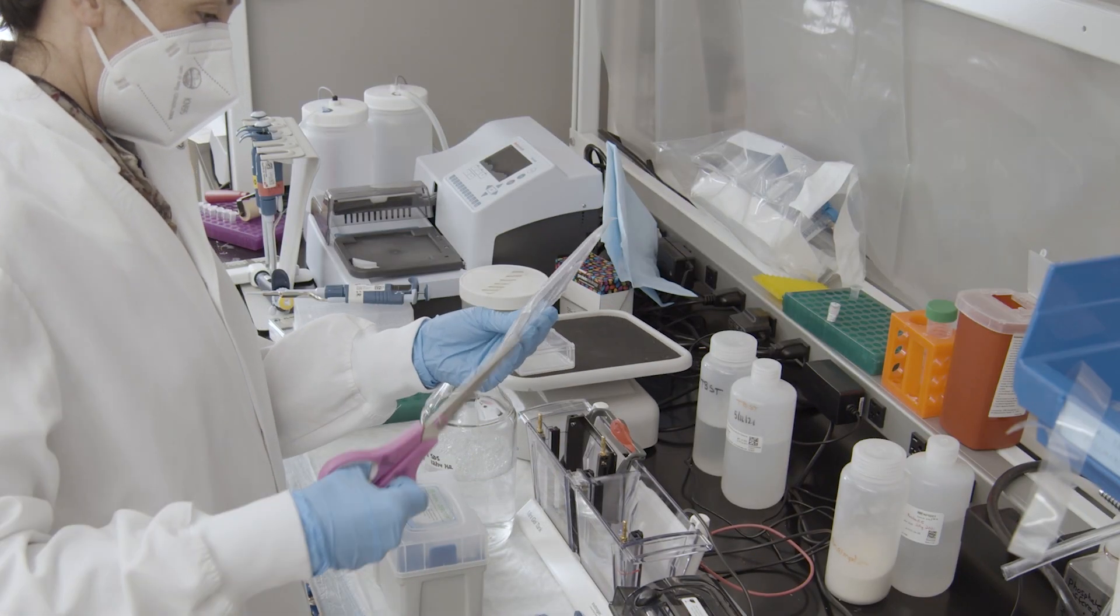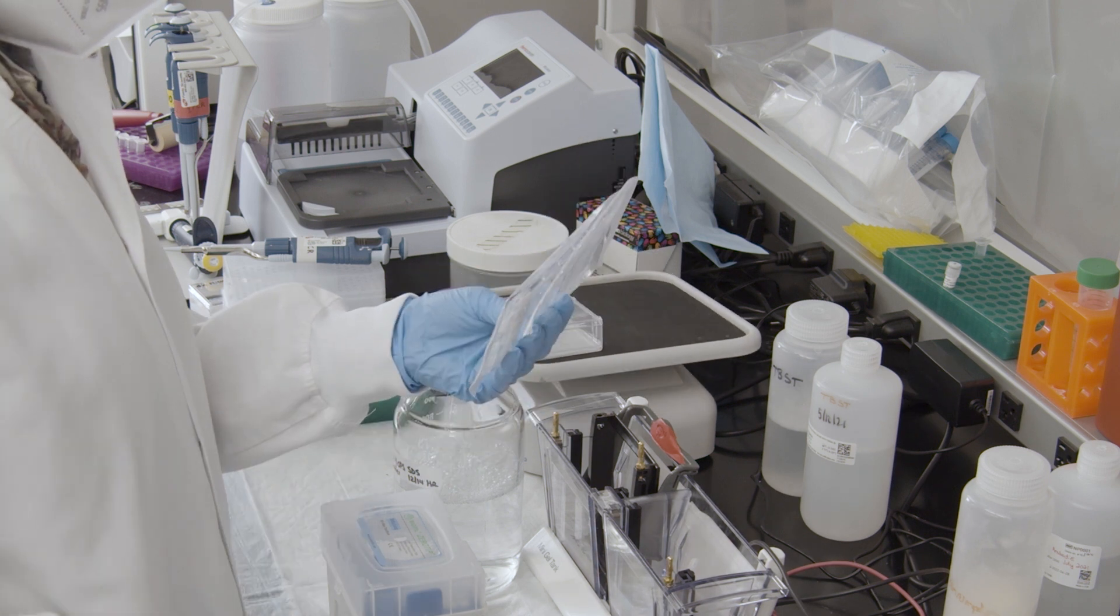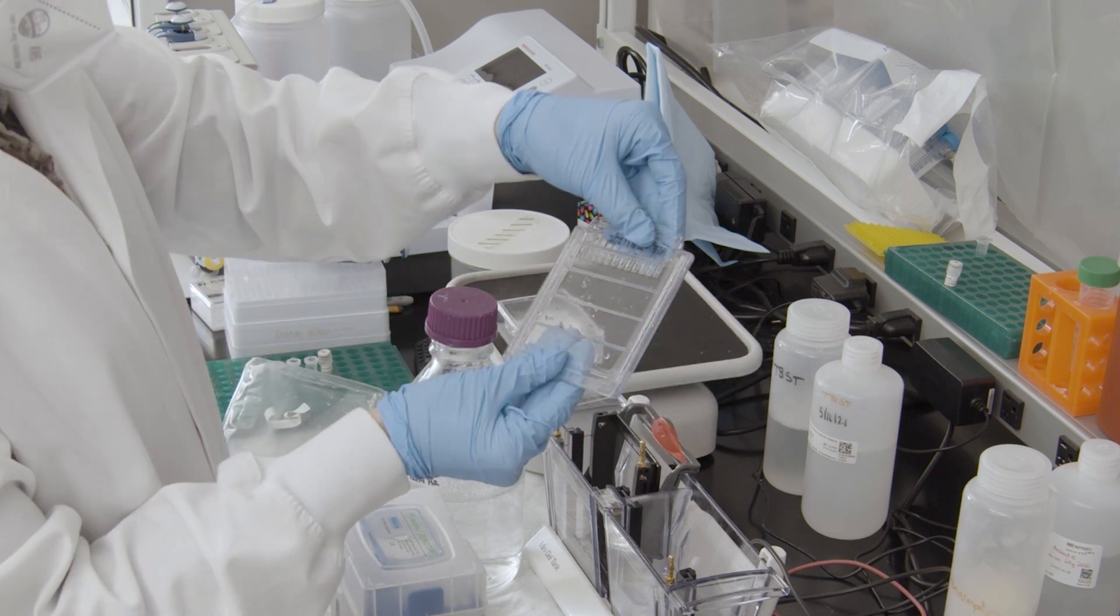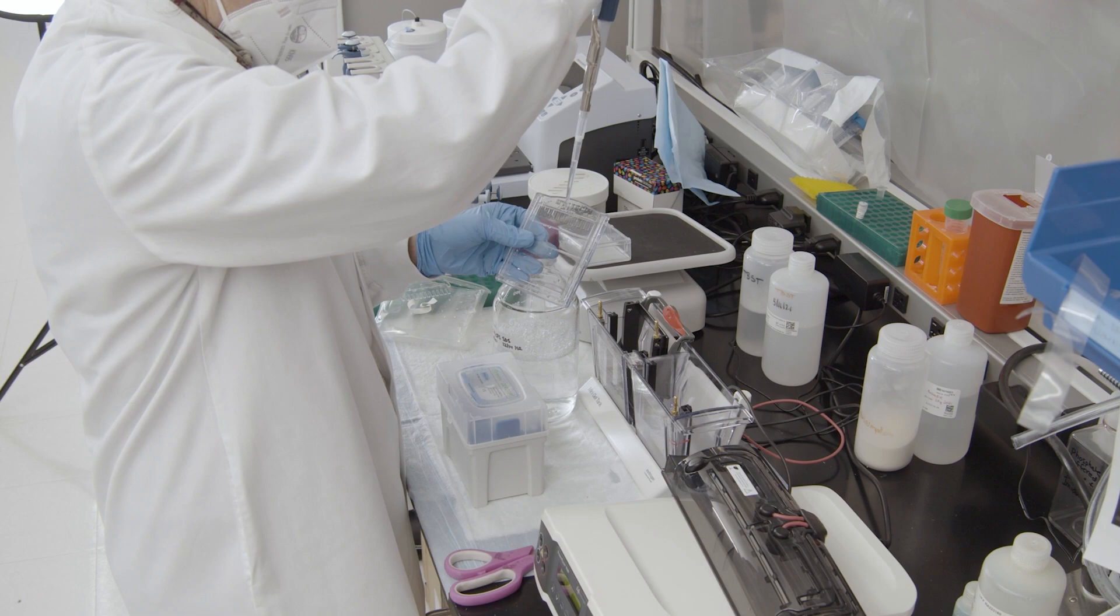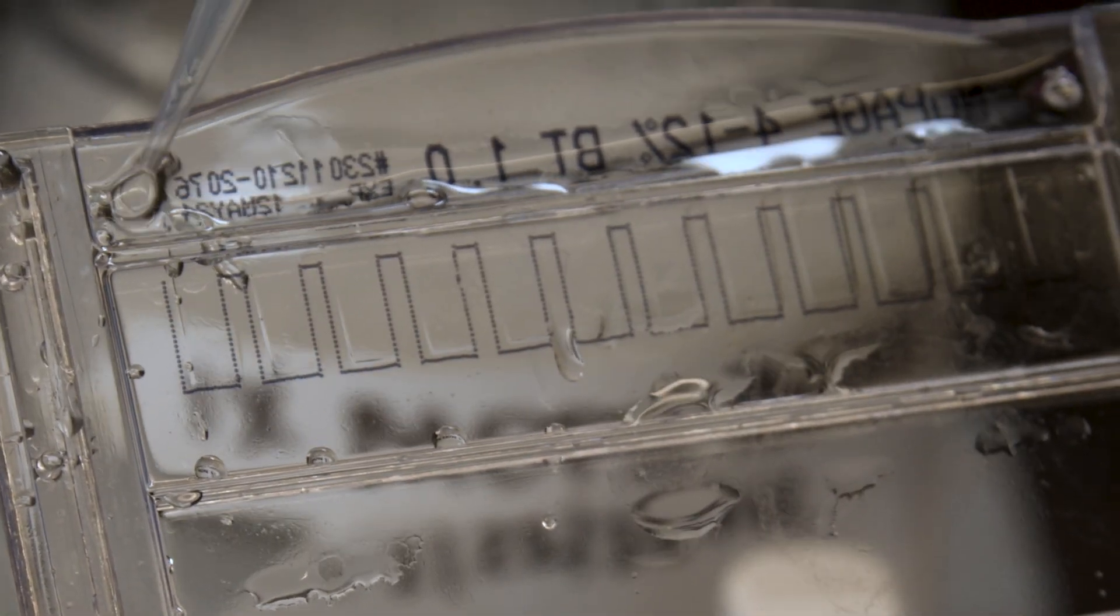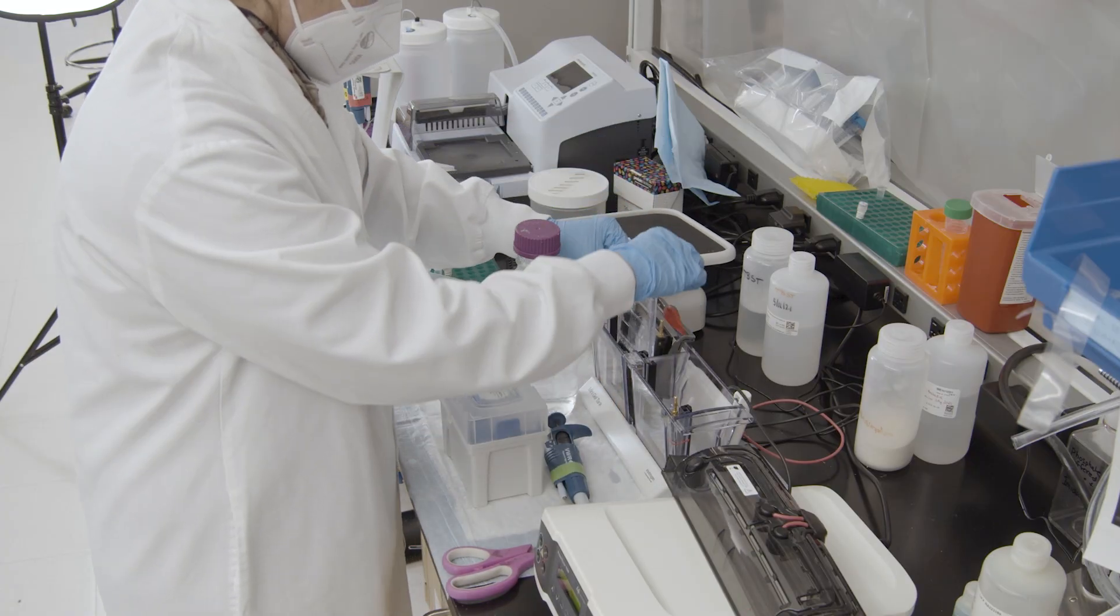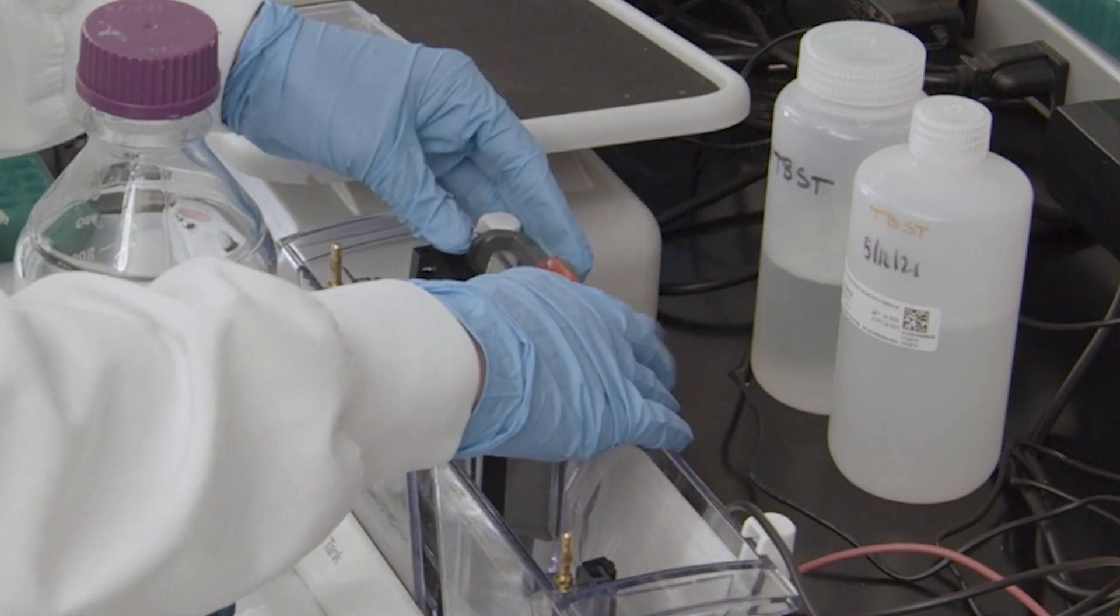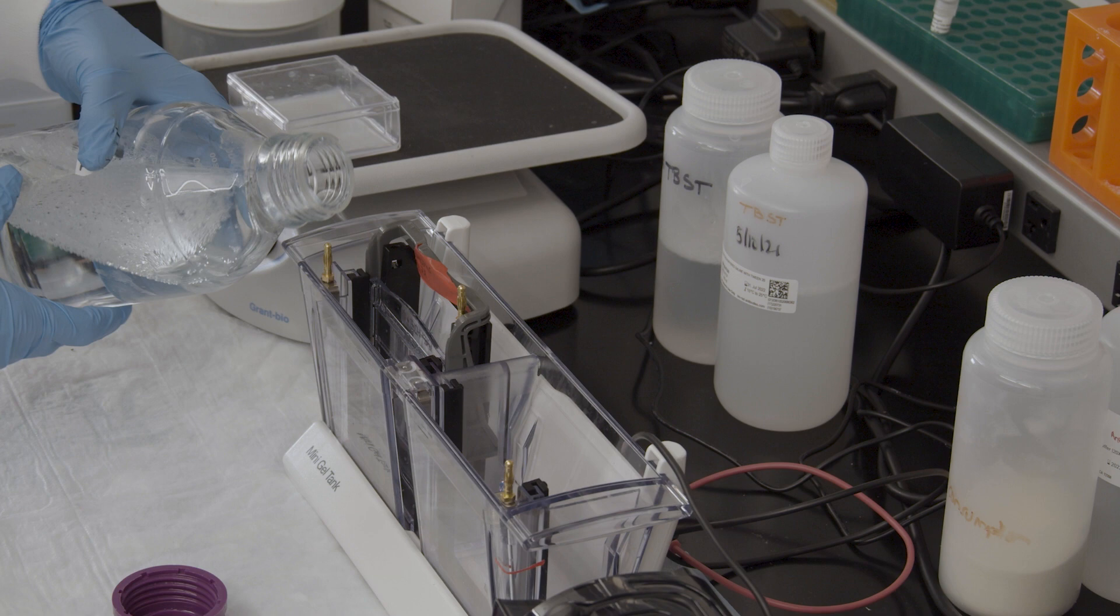SDS page gels can be hand cast or purchased precast from a variety of vendors. For both gel types, remove any packaging or casting material in combs. Use a pipette and tip to gently rinse the wells in the running buffer, removing the packing liquid and any air bubbles. Gently load the gel into the electrophoresis chamber and lock it in place. Fill the chamber to the fill line with the running buffer.